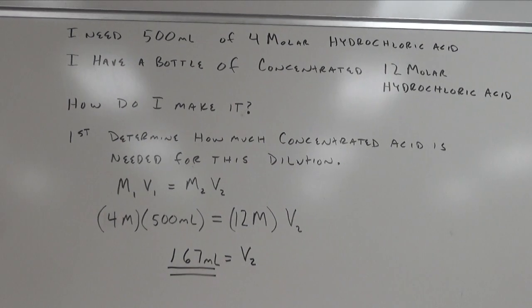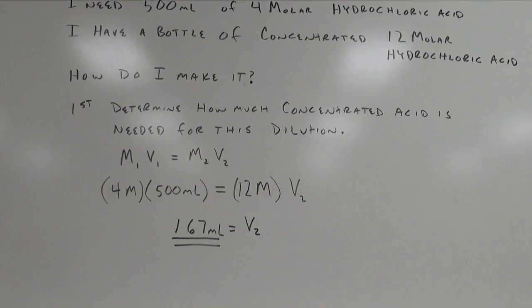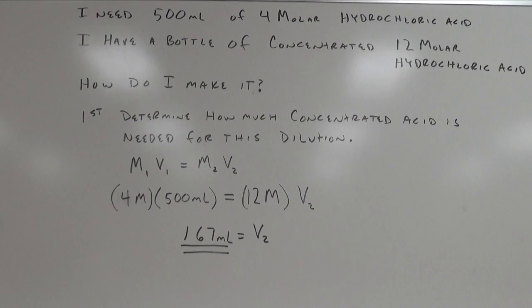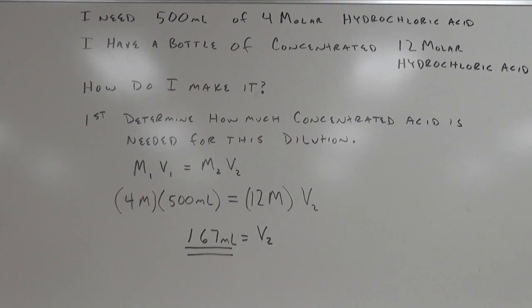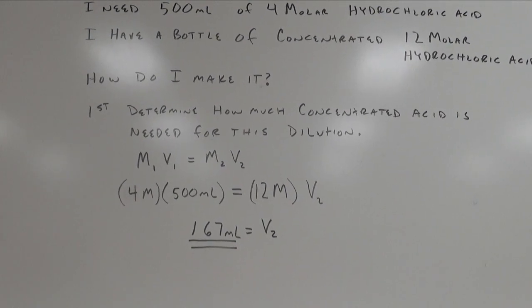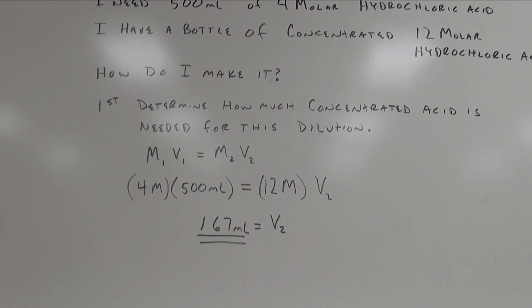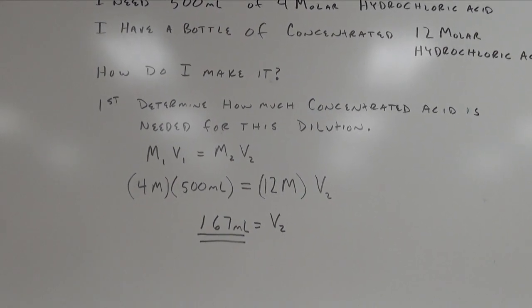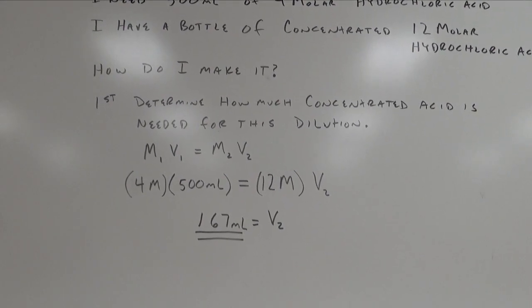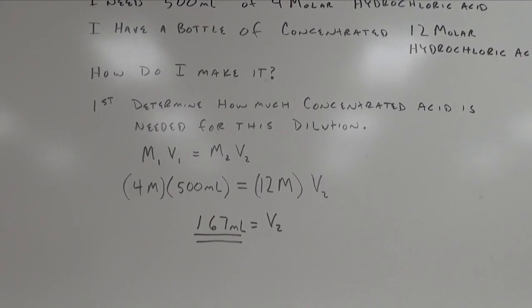Well, you're going to dilute the concentrated. And so the first thing you need to do when doing this type of problem is determine how much of the concentrated acid is needed for this dilution. There is a dilution formula when we get to solutions that you'll learn, which is molarity 1 times volume 1 is equal to molarity 2 times volume 2. So since I need 500 milliliters of the 4 molar, I'll put that on the left side and determine how much of the 12 molar I need on the right side. For this lab, I will need to dilute 167 milliliters of the concentrated acid.